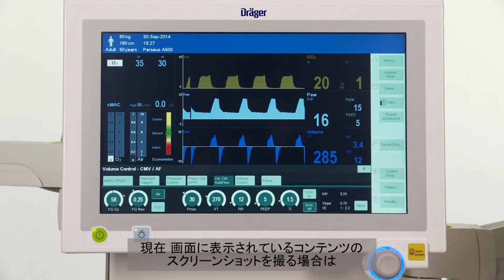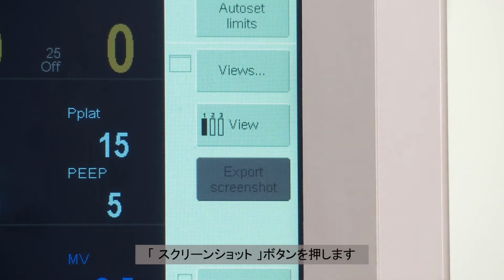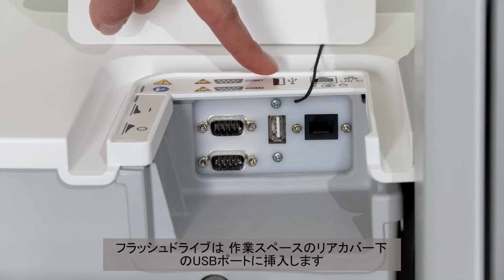If you'd like to make a screenshot of the content currently displayed on the screen, press the Export Screenshot button. The screenshot is saved to a flash drive, which must be inserted into the USB port underneath the work surface rear cover.